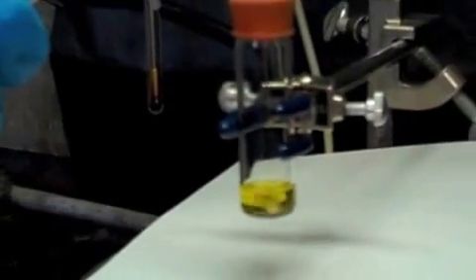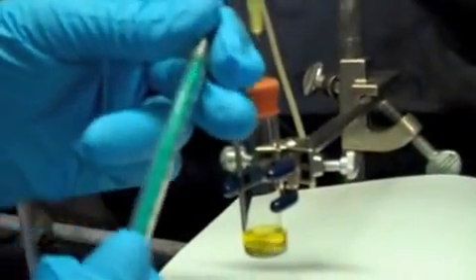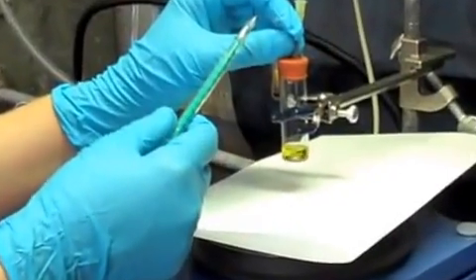As we near the end of the titration, the yellow color lingers for a longer period of time. I'll slow down to wait for it to disappear. Once the yellow color persists, your titration is complete, and you should read the volume on the barrel of the 1 ml syringe. The volume is 90 microliters.